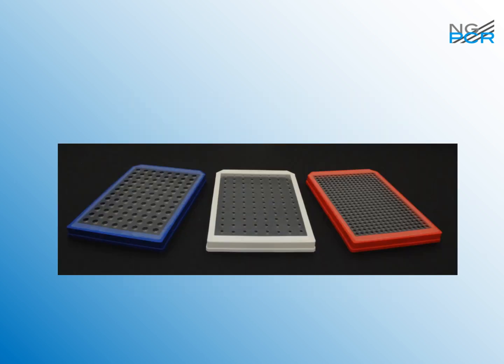Now here is an interesting, let's say, result of the design of the machine. The 6 blocks that we have, the bottom blocks on the top and the top blocks on the bottom of the blocks, have flat surfaces. So a top block has a flat surface on the bottom, and a bottom block has a flat surface on the top. So the wells are met, when the blocks squeeze together, by flat surfaces. That means I don't need to put in a specific sort of plate.